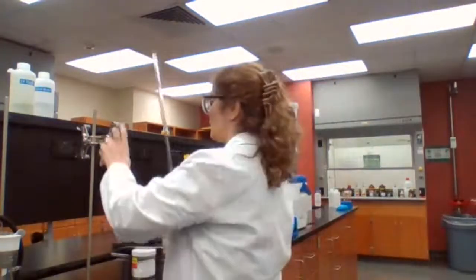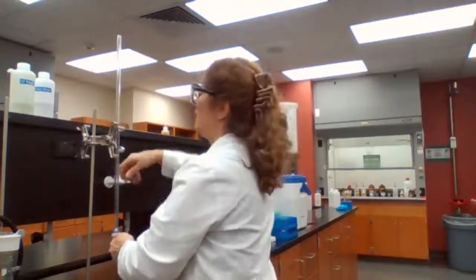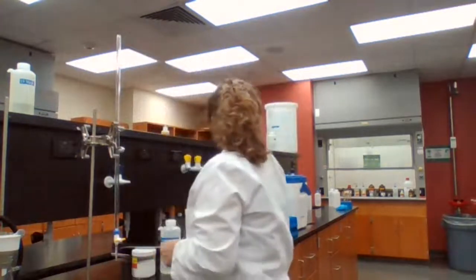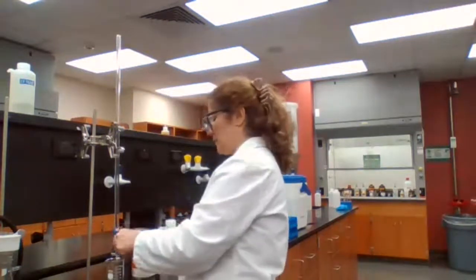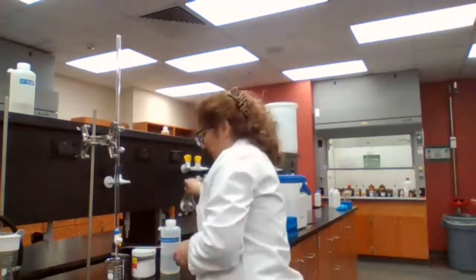Set up a burette, okay? I always like to make sure that the burette is working, so I add some water and drain it to make sure it's working. Good. What is the next step?